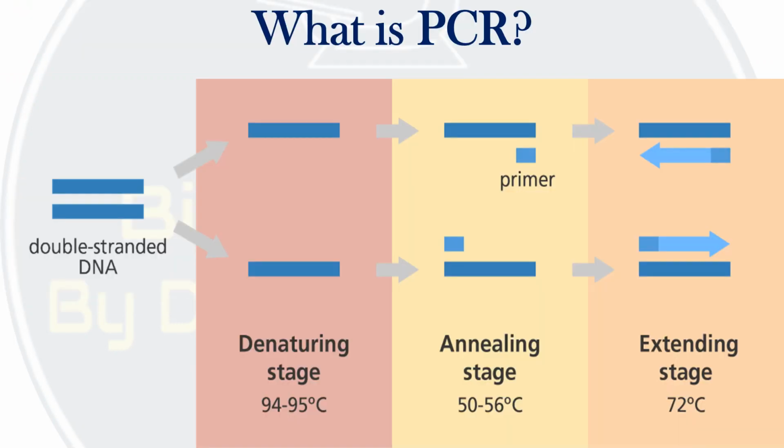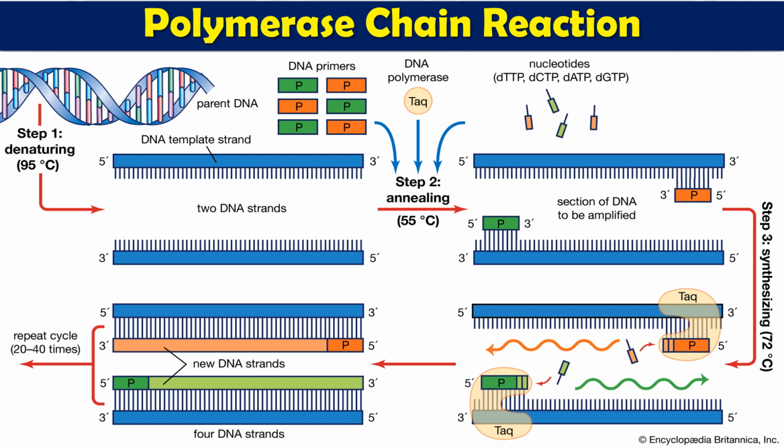This is the basic conventional PCR, where we have three different stages: denaturation, annealing, and extension. All three processes occur at different temperatures. Denaturation occurs at roughly 94 degrees centigrade. Then we have annealing, where the primer binds with the single stranded denatured DNA, at around 54 degrees centigrade. And lastly we have extension, where thermostable DNA polymerase extends it. This is the same conventional PCR shown in detailed stages.